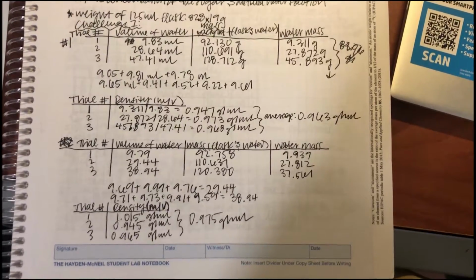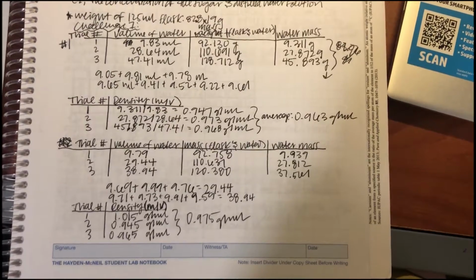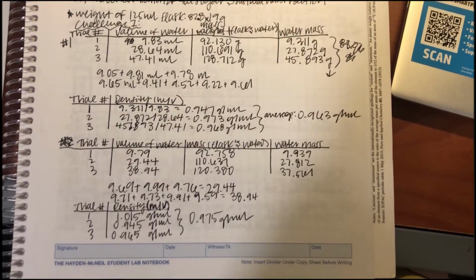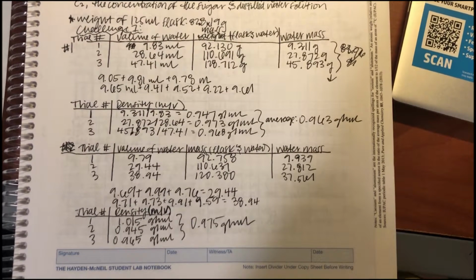This data shows the process of determining the concentration of the diluted solution and the density of the stock solution. The diluted concentration was found with the C1V1 equals C2V2 formula, and the average density of the stock solution was found to be 1.36 grams per milliliter.